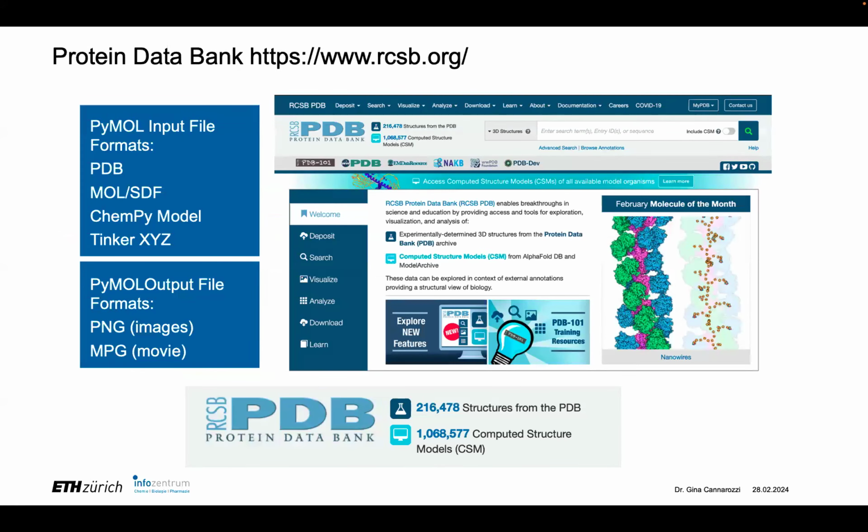Okay, so as I mentioned, the input files are 3D coordinates. The most common place that we get input files is from the PDB, the Protein Data Bank. Here is the data bank that holds all the experimental structures. So around now, there's 216,000, this was this morning, structures in the PDB, but it also has a lot of computed structures, and the AlphaFold protein structure prediction program outputs its predictions in PDB format, so you can read all of those in also.